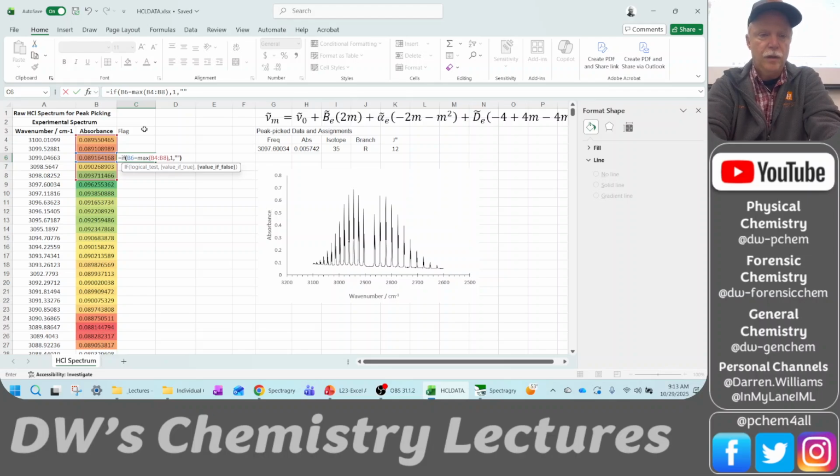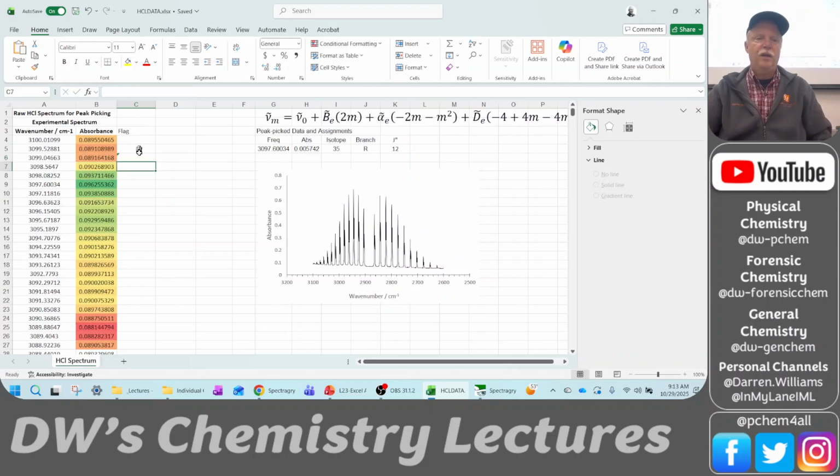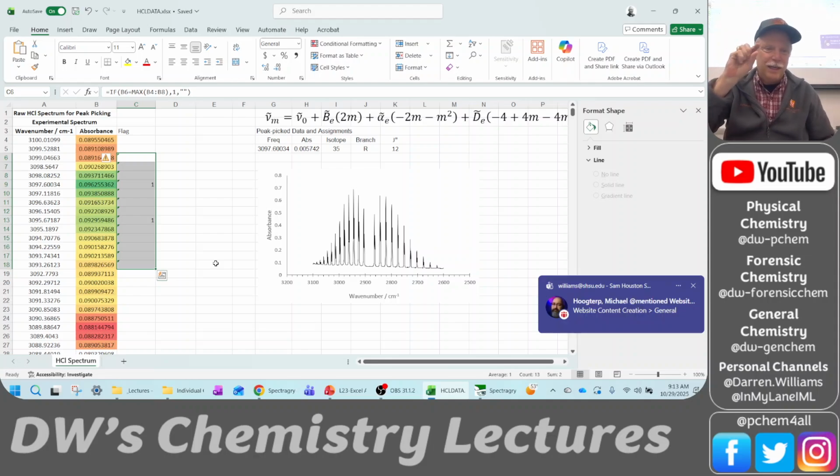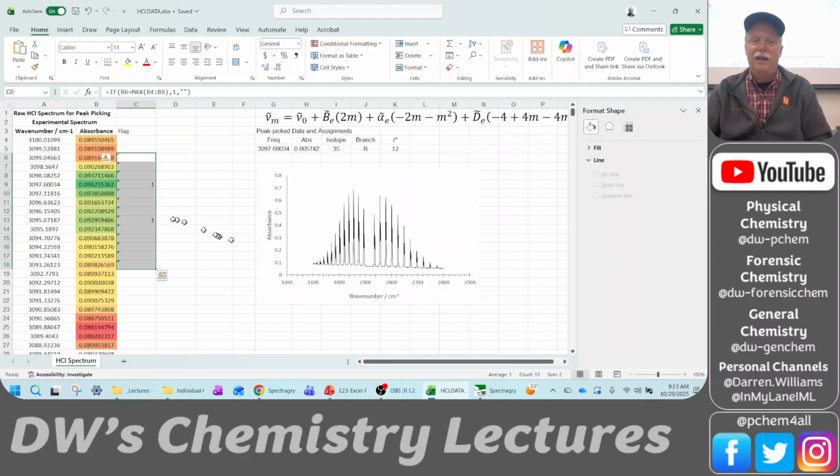Otherwise, I'm going to return a flag of nothing, okay? And I'm going to close parentheses. So I don't get a 1 here, but if I'm scrolling along past this, bing, bing, it finds the max. And I don't have to look in there to say, oh, it's 0.93 and then 0.96 and then 0.94 and all of that stuff. So it's a fast way to flag the peak maxima. And I can check that to make sure it's green as well.